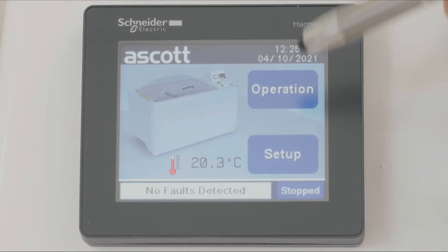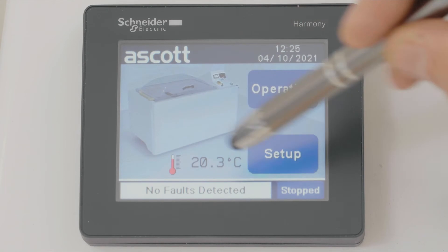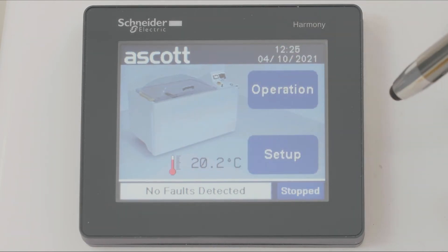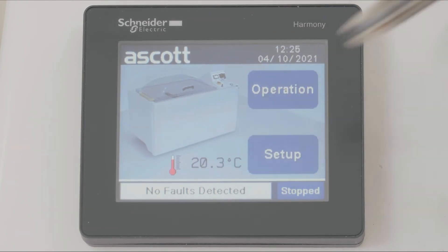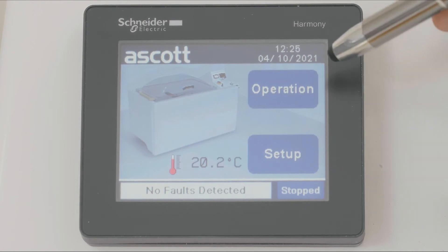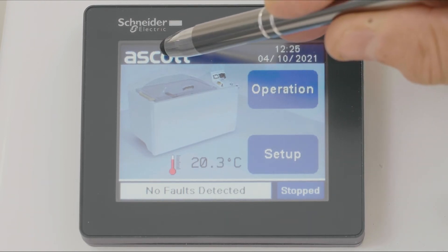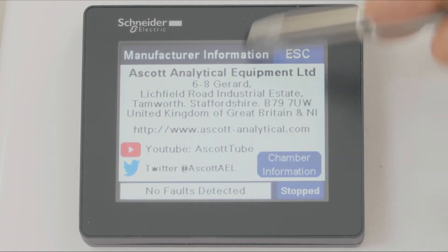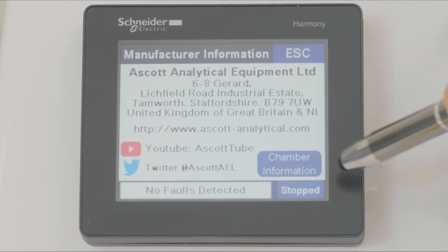From startup, the screen will initially display the home page. From here we can access various menus. If we press the Ascot logo, we find the Ascot details or your supplier details.